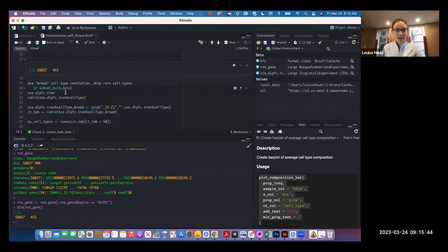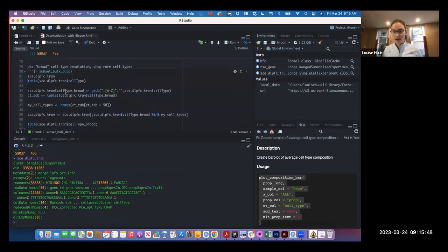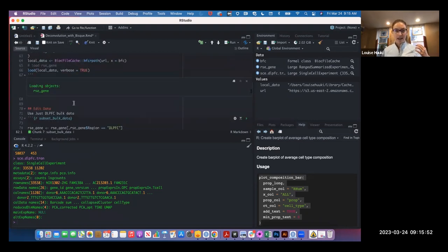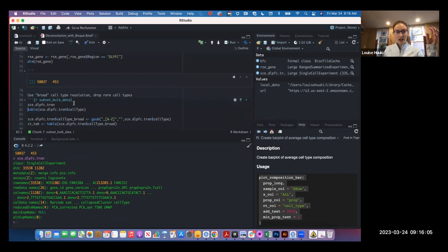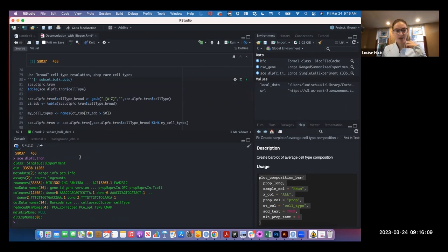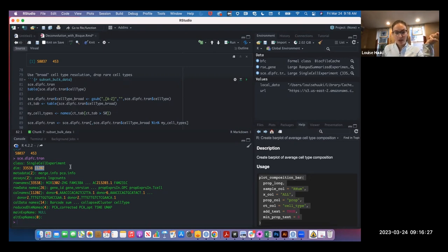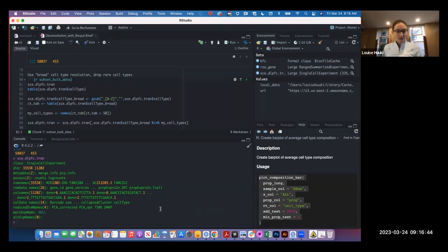Now we look at the SCE data, which will act as our reference set. The RSE object is what we're treating as our experimental data to analyze, while the SCE is more like an off-the-shelf reference. This is again from Tran's work in the DLPFC. This object is quite a bit larger - we have 11,202 cells or nuclei, compared to our 453 bulk samples. Single-cell experiment objects are bigger than bulk ones and use way more memory. We have 11,000 nuclei with expression across 33,000 genes, and count and logcounts assays.